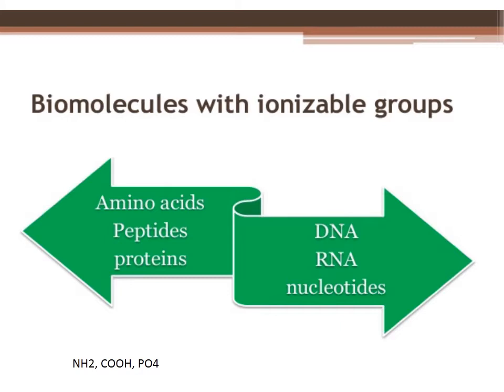Nonetheless, biomolecules contain many different types of functional groups on them which can bear charge. And based upon these functional groups which impart charges to these biomolecules, separation can be done by using electrophoresis.